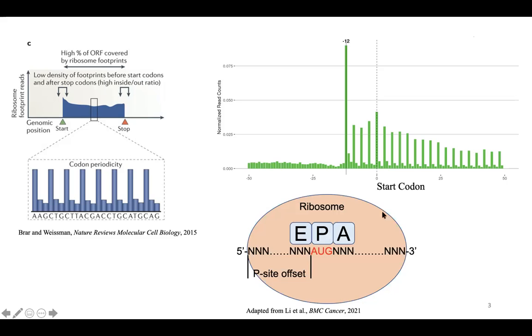It is because when the ribosome P site is aligned to a codon, the 5' end of the read is actually upstream. And we usually only take the 5' end to represent a read for our Ribo-seq data. The P-site offset is a very important number to determine. Based on this number, the Ribo-seq reads need to be shifted downstream before further analysis.